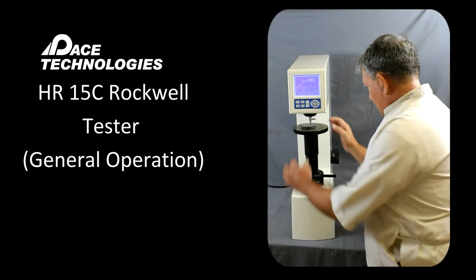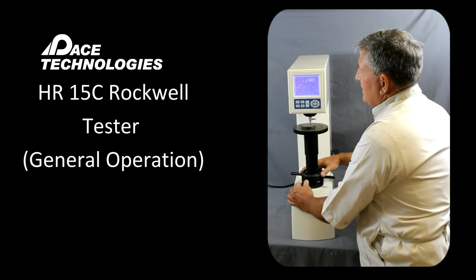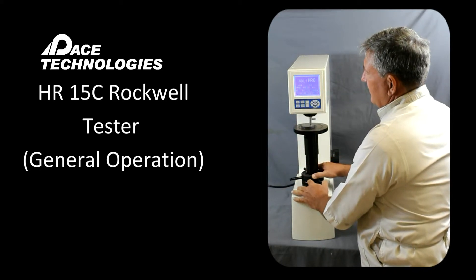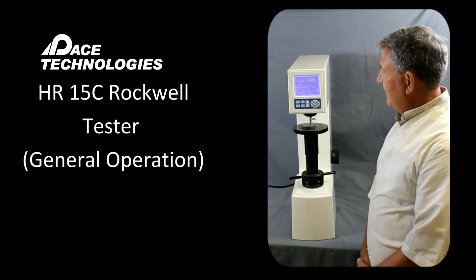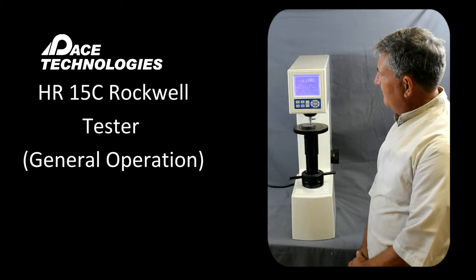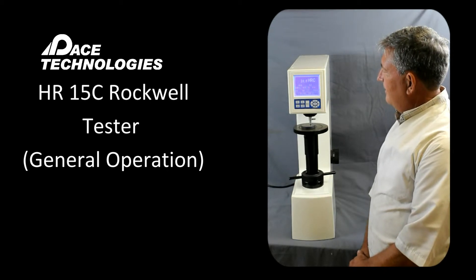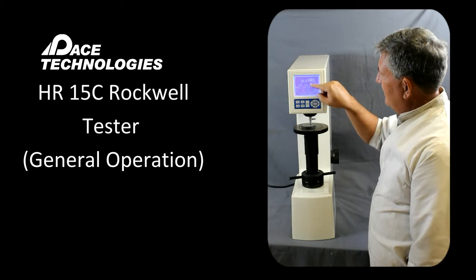To make the measurement, go ahead and locate your specimen, then rotate the stage or screw up. If there's a value here, you'll see an increase up to a value of 580, and then it'll chirp. At this point it'll apply the minor load. Once the minor load is applied, it'll switch over to the major load and apply that load for the set dwell time. That second chirp will show you the hardness value on the LCD screen.